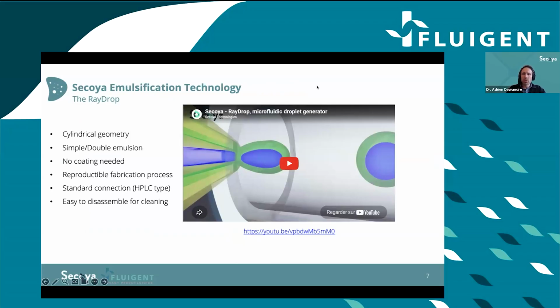And I will show you now a short video to explain how this device works.